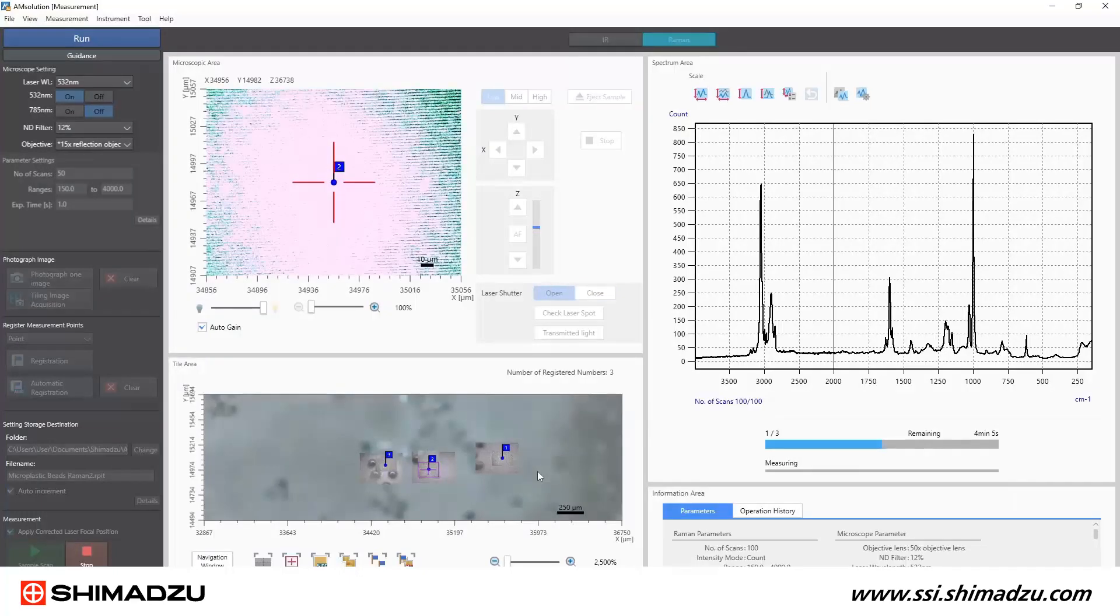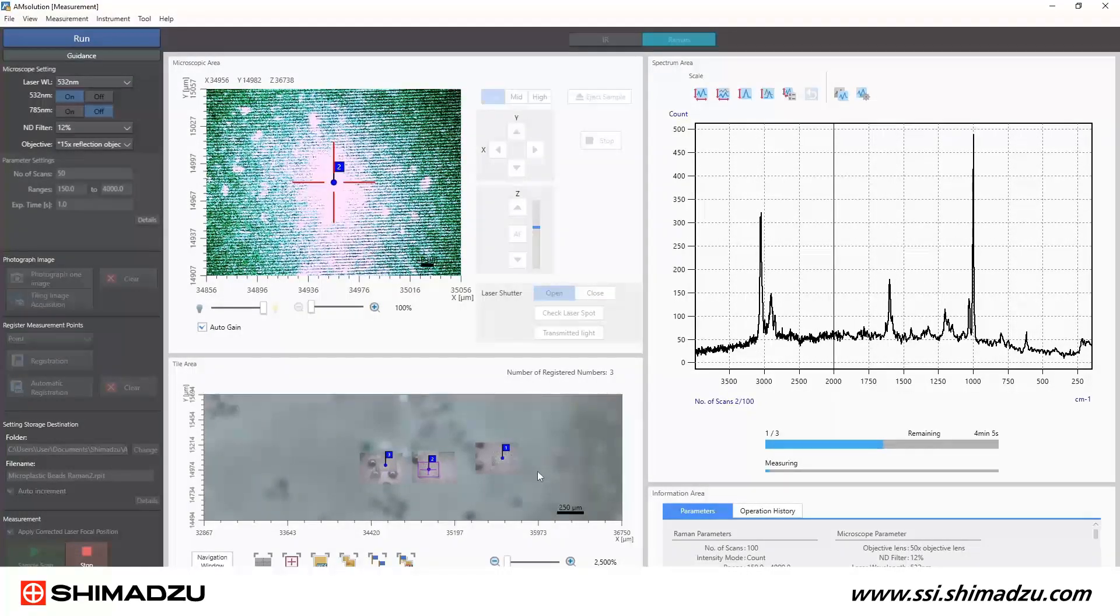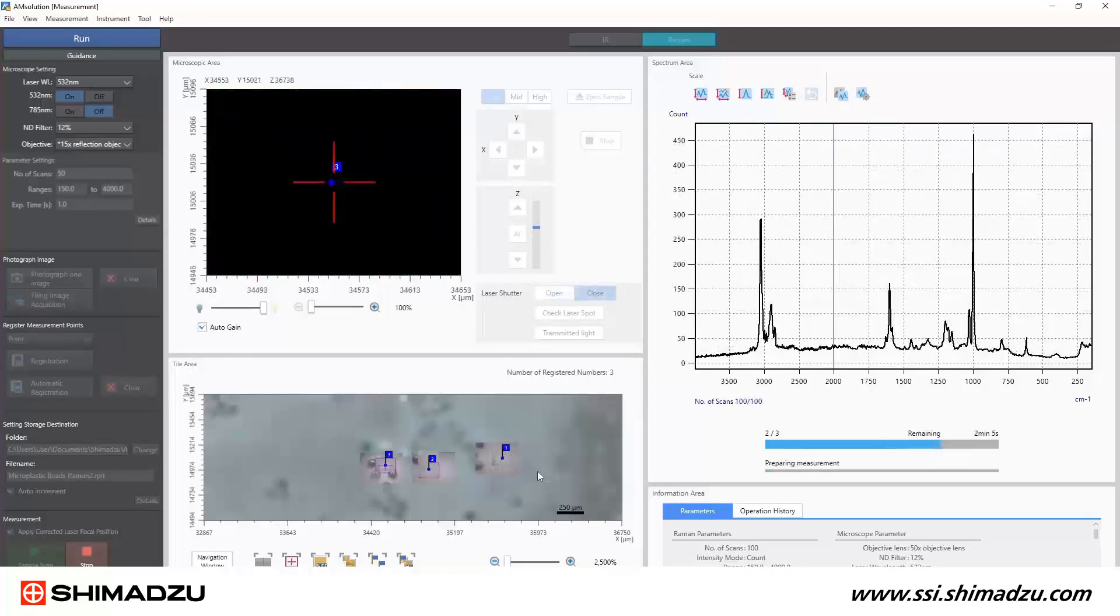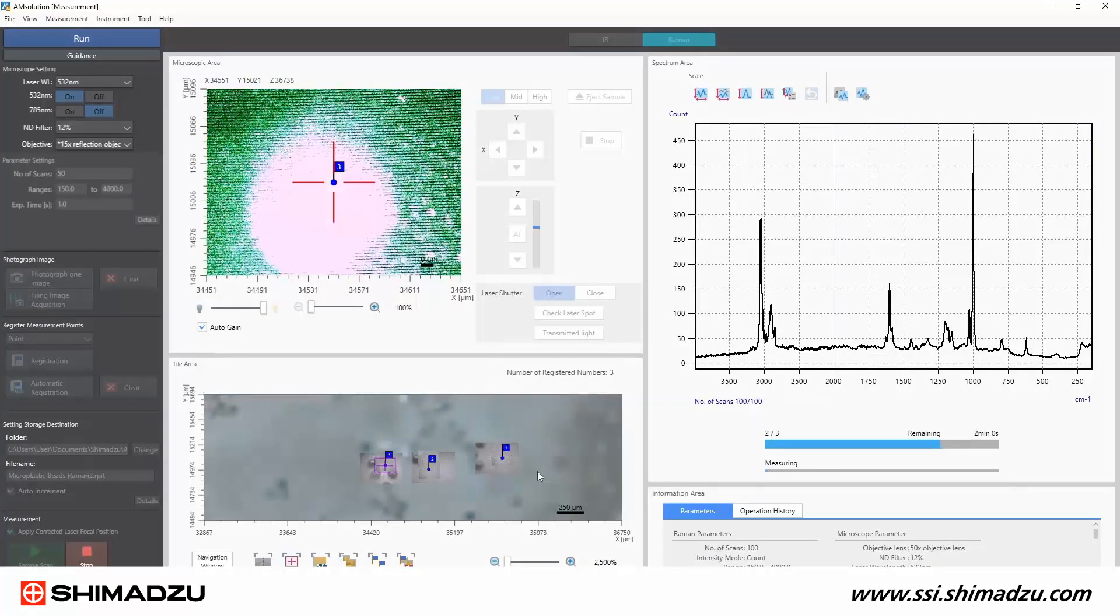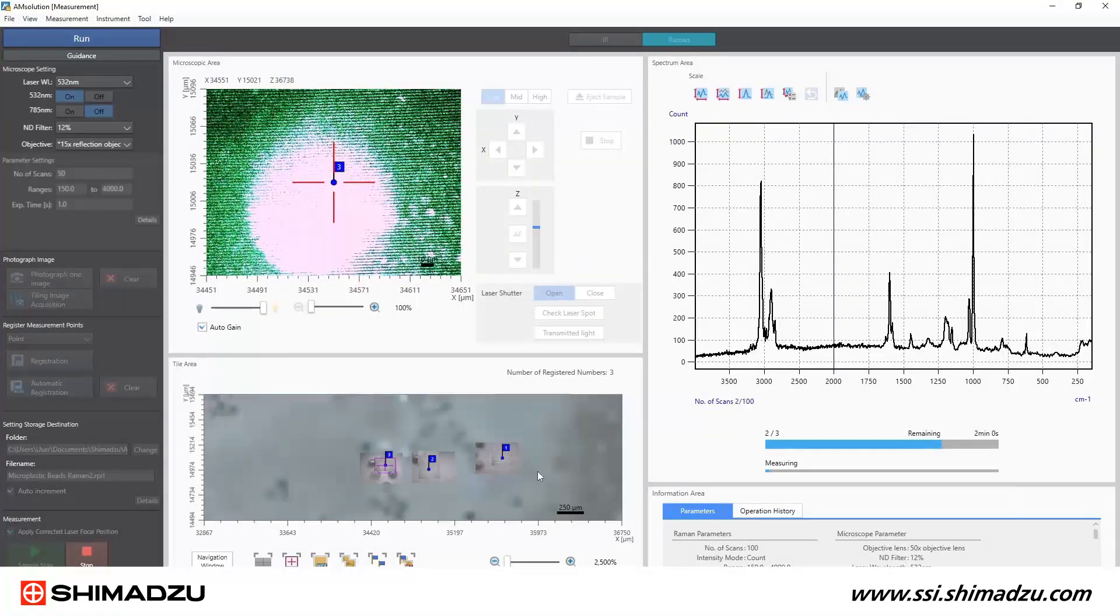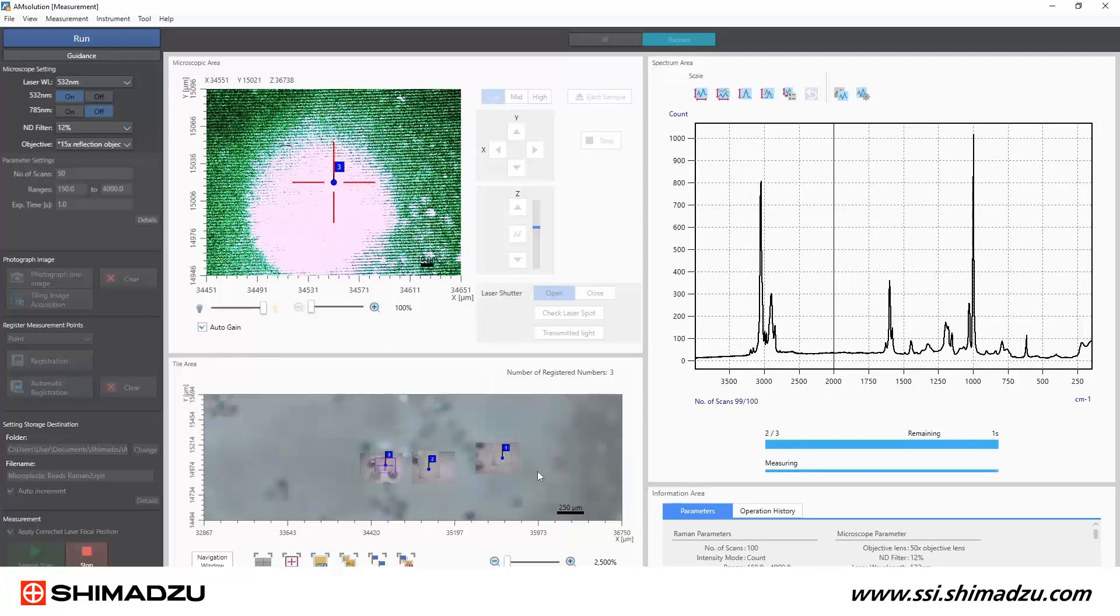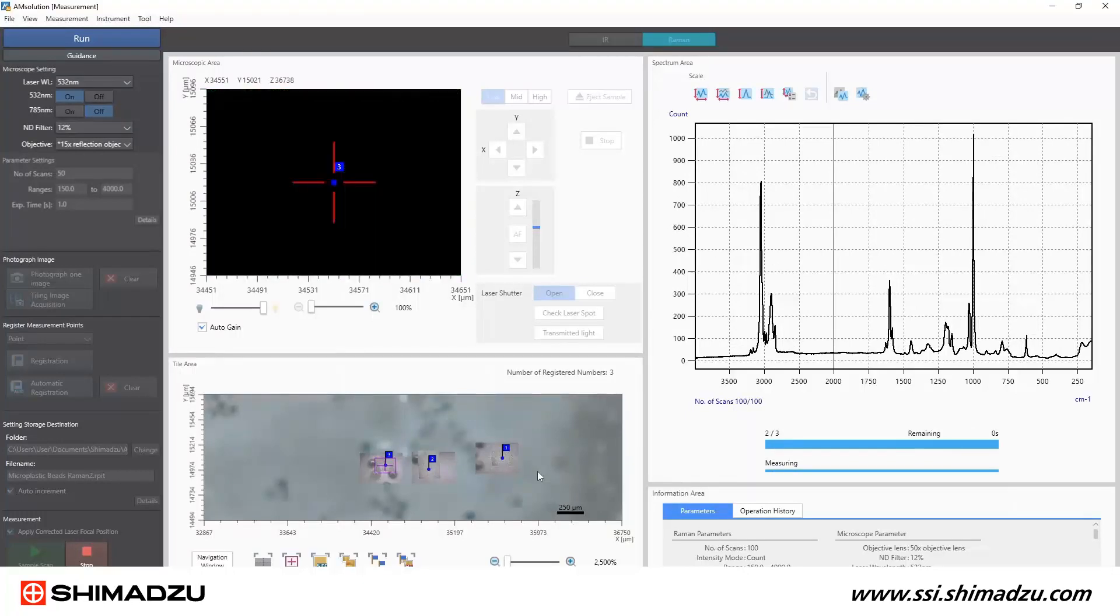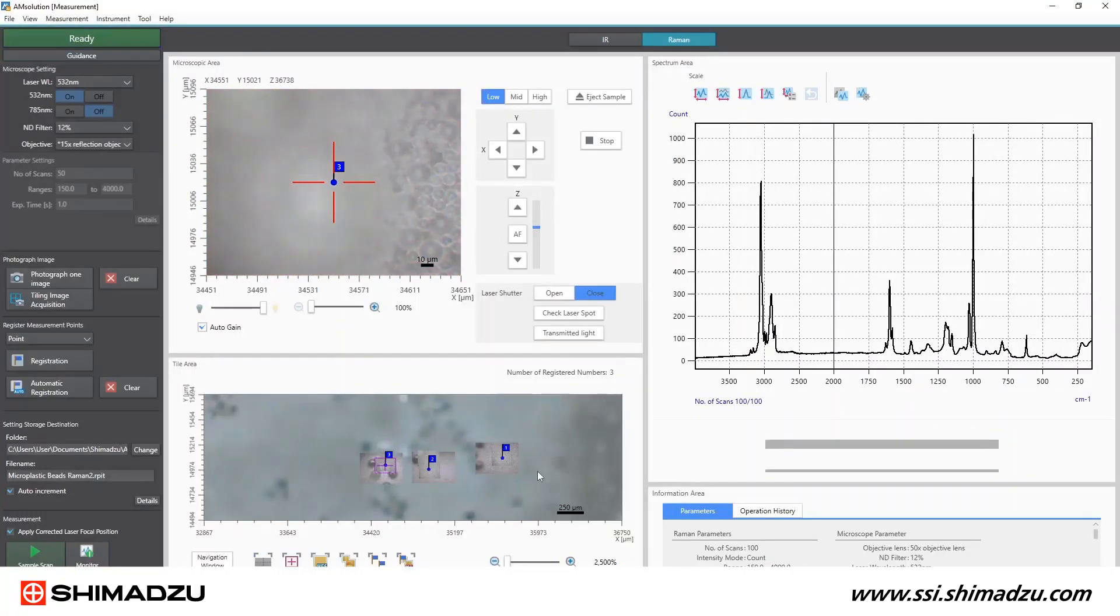As soon as the first spectrum is collected, the AM solution analysis software will open automatically and populate with that data. Here is where you have some options to correct, analyze, library search your data, and determine lengths of particles.